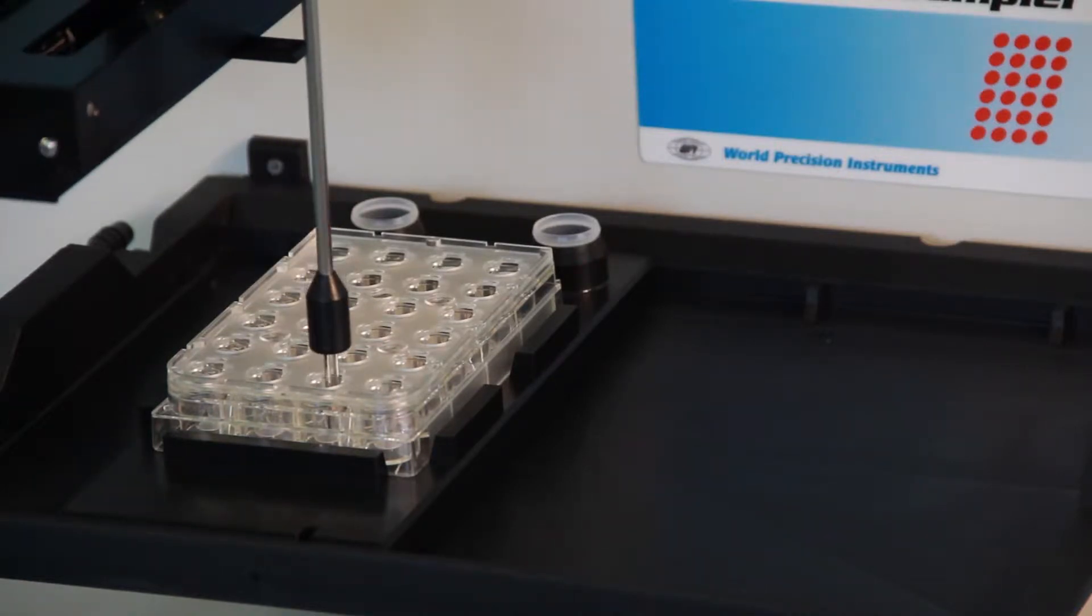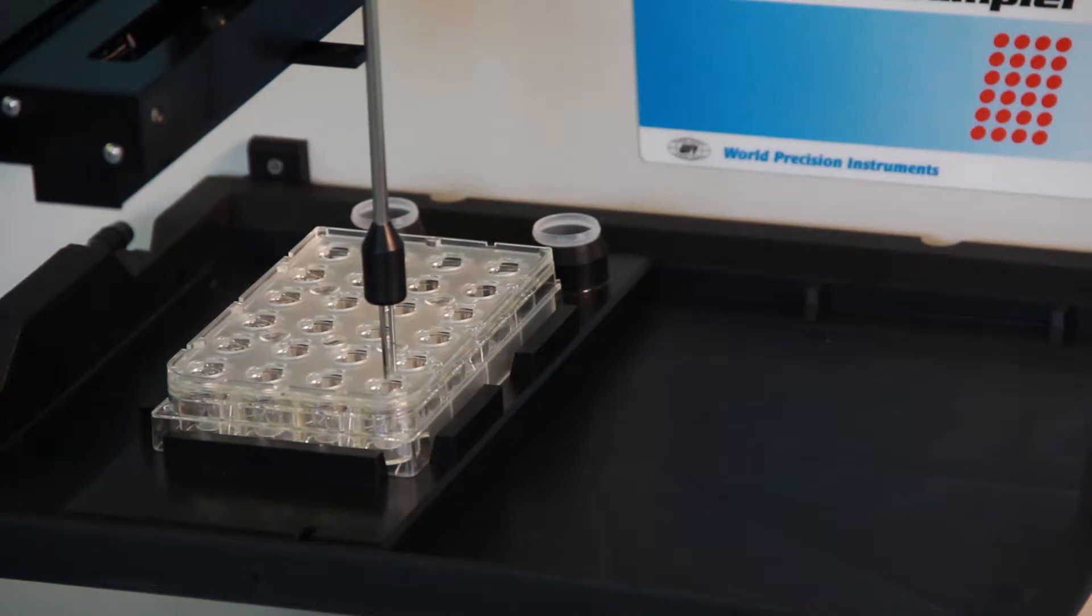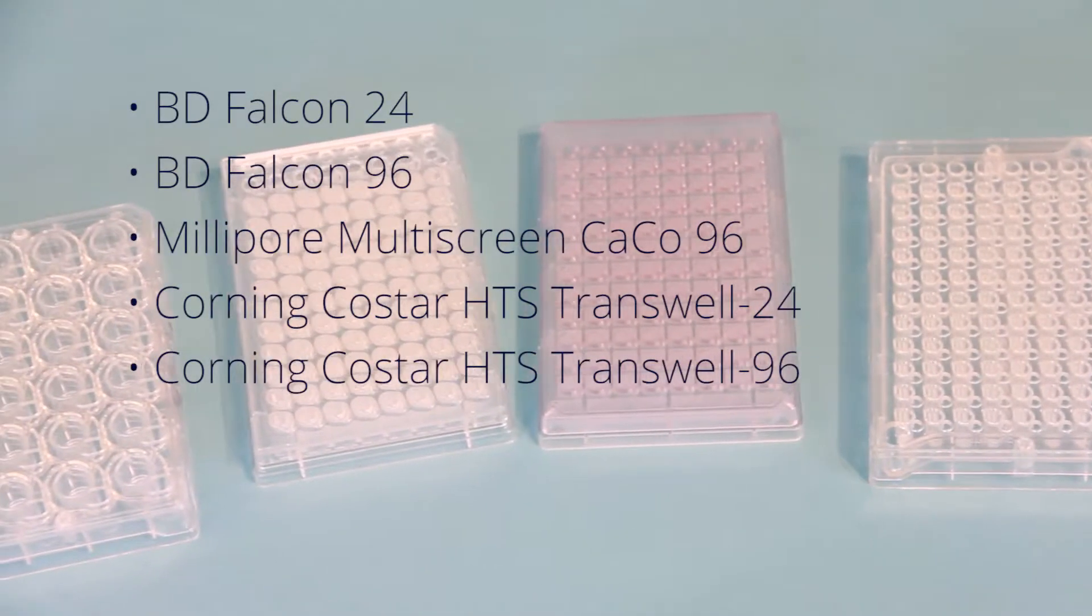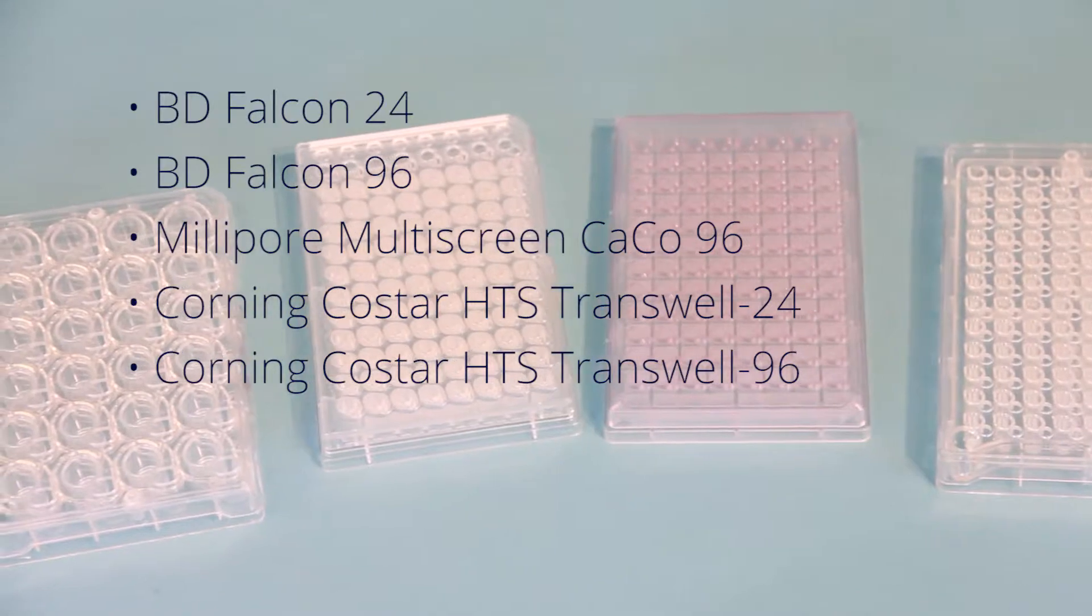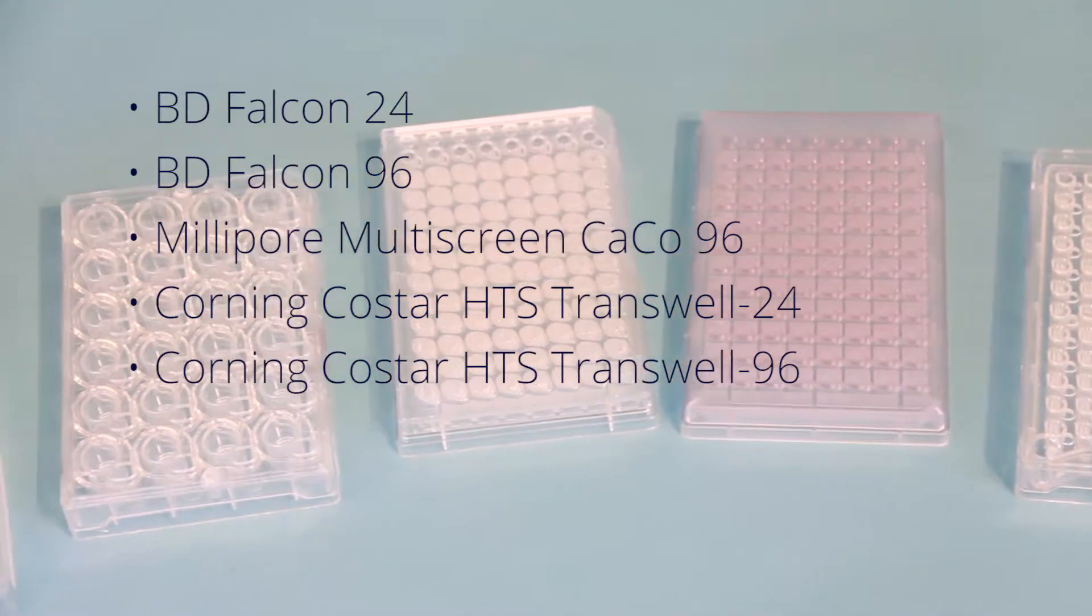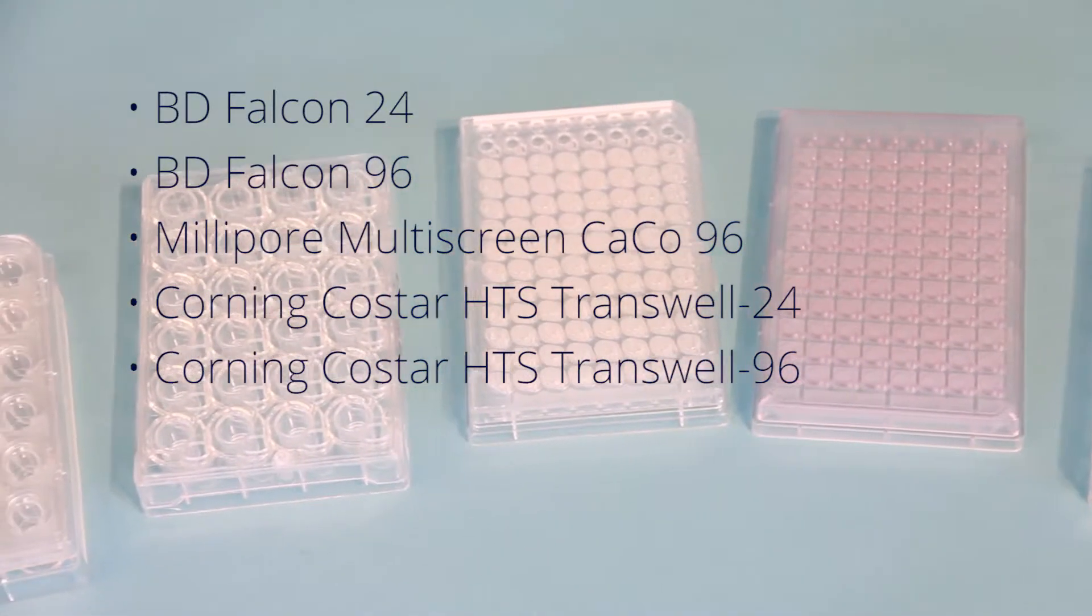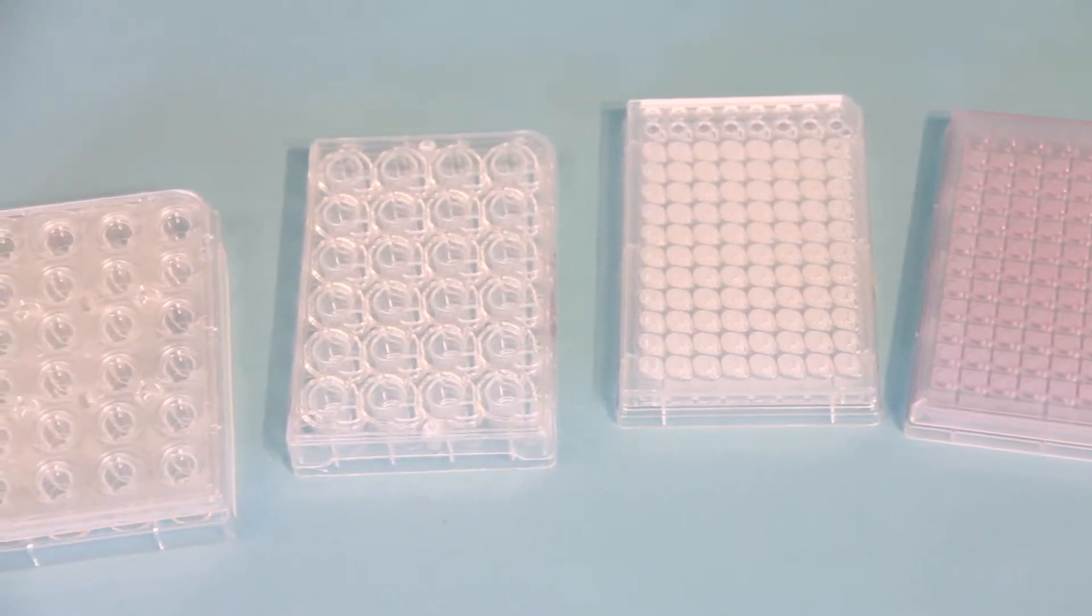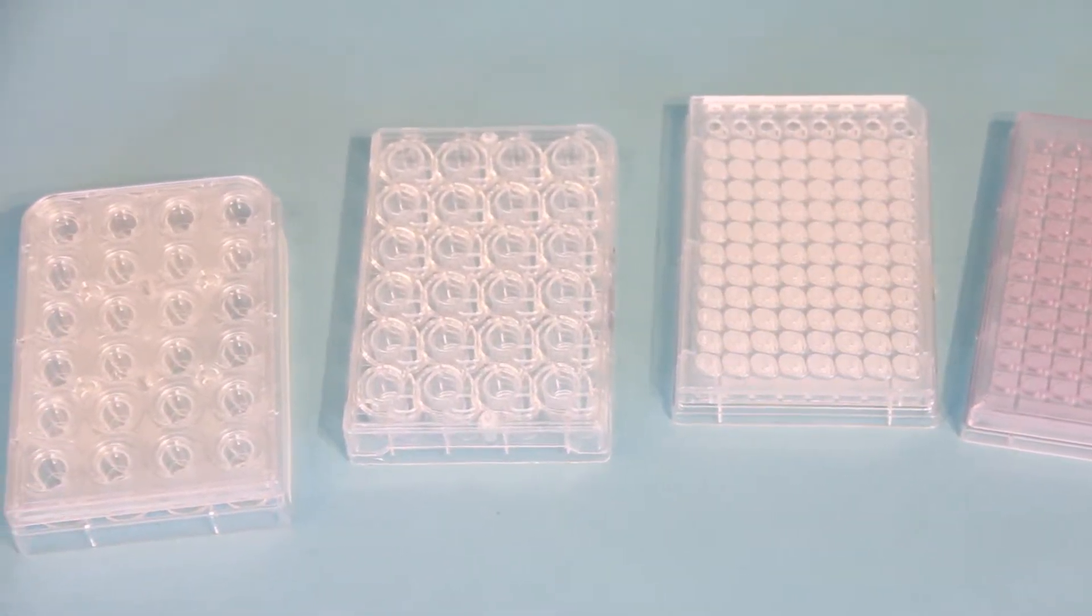REMS is unique in providing a cost effective alternative to manual confluence verification for institutional research and preclinical pharmaceutical studies. WPI has designed REMS electrodes compatible with the major manufacturers of HTS well plates such as Millipore, BD Falcon, and Corning CoStar. This makes it easy for researchers to choose an industry standard well plate that best suits their cell line.